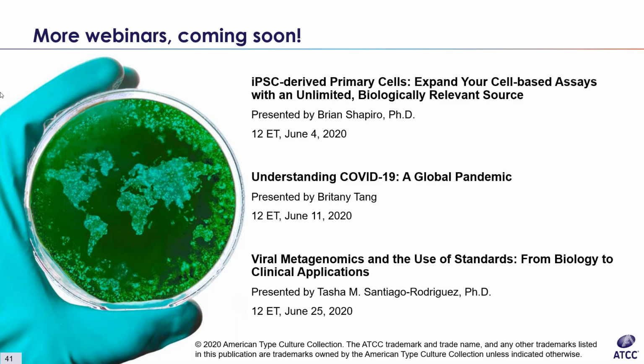A couple of different things. Probably the most common reason is that the pH is not optimal, so you're probably having incorrect buffering with your system. This could be due to an imbalance in the percent of CO2 in the incubator, or the amount of sodium bicarbonate you use in the media. But it's usually some sort of a pH problem that causes detachment.